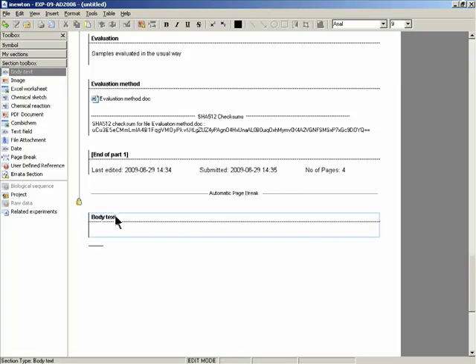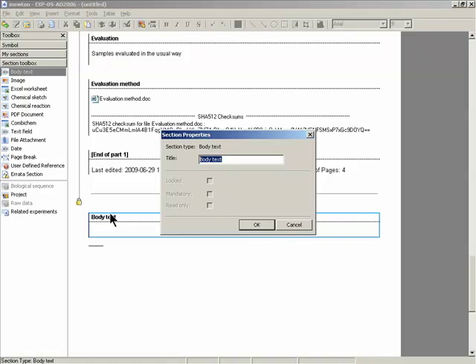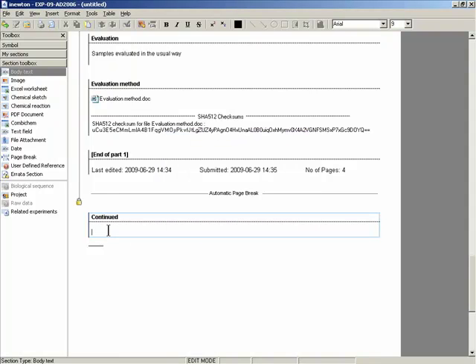Of course, when an experiment is signed and witnessed, it's not finished with. You can always add more sections. So we're back at the experiment now. We're adding another section. Maybe we got some analysis results back a few weeks later. Maybe the experiment's going on over several weeks and you want to lock it during that time, submit over different days.